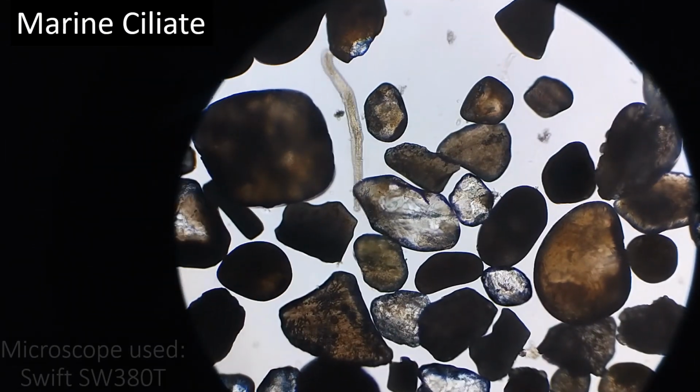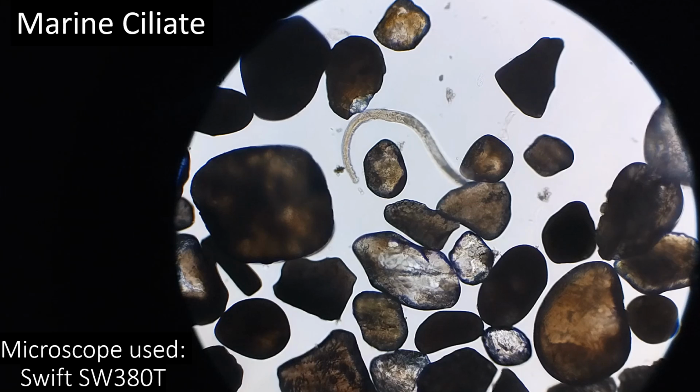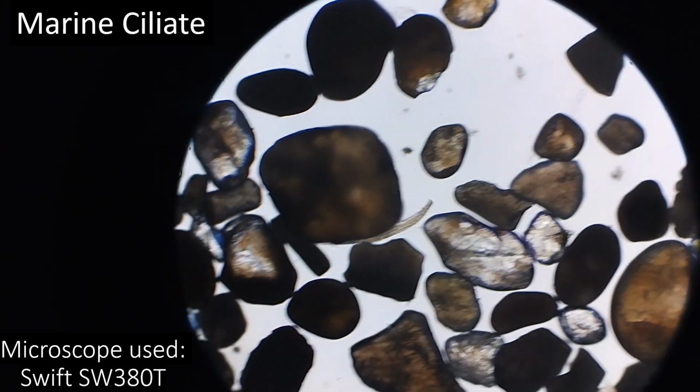And lastly, we have some marine ciliates like this one, which crawls between the sand grains like a worm.